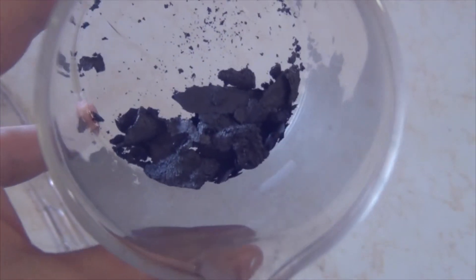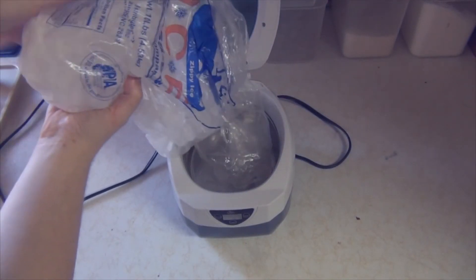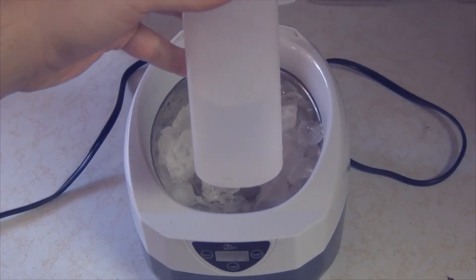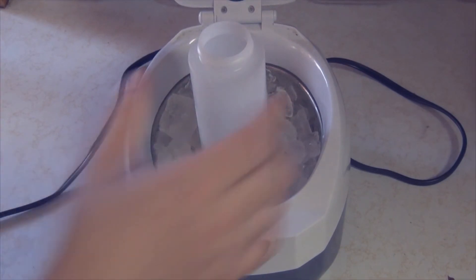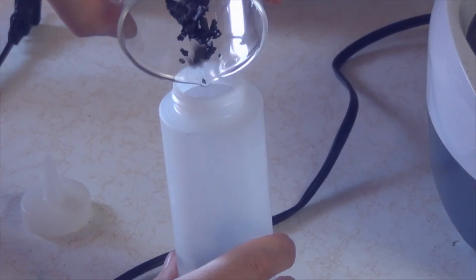Once everything dried, transfer it into a beaker. It's not quite graphene yet — we need to use our ultrasonic cleaner to break up the particles even more. Add some ice to the ultrasonic cleaner because you don't want it to get hot; if it does, it will turn your graphene back into graphite and all that work will have been for nothing. Take your squeeze bottle with clean deionized water, add a little tap water to the ultrasonic cleaner, and make an ice bath.